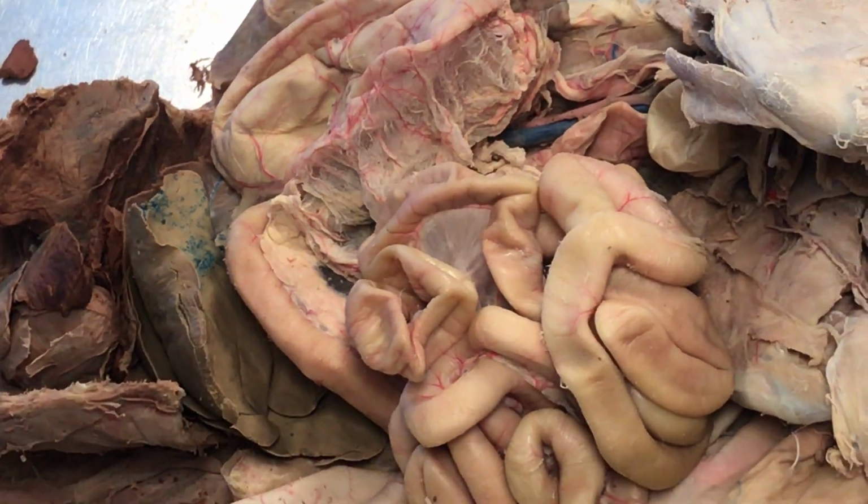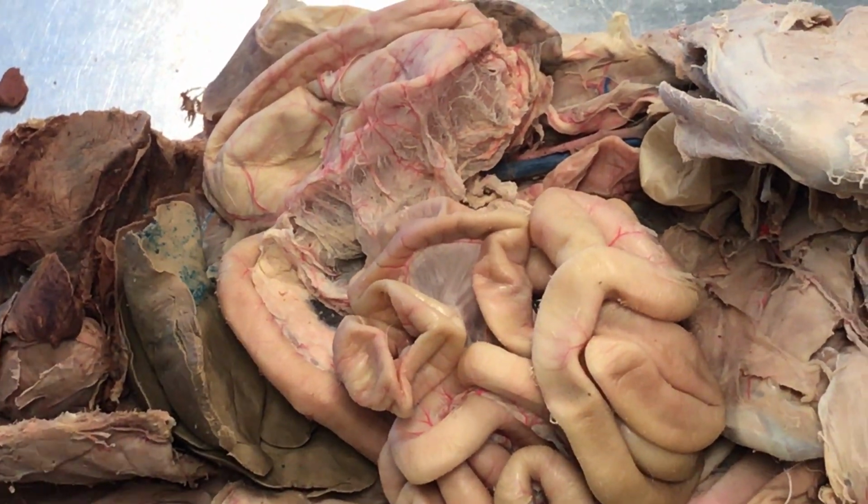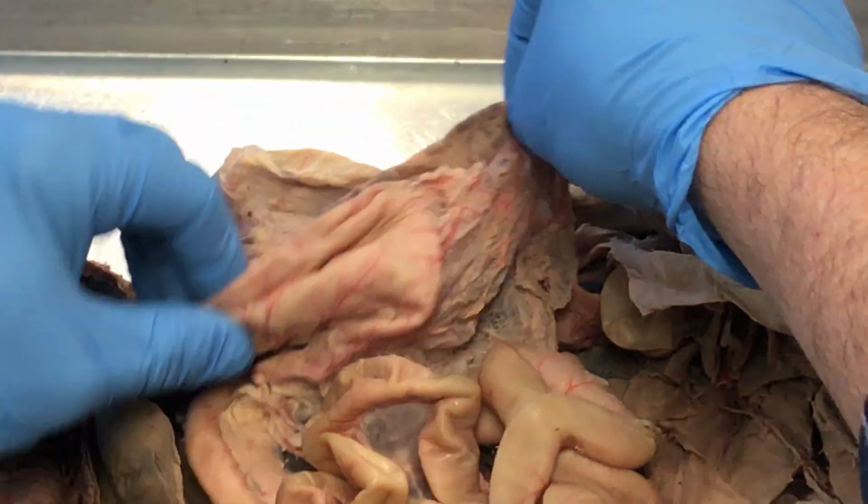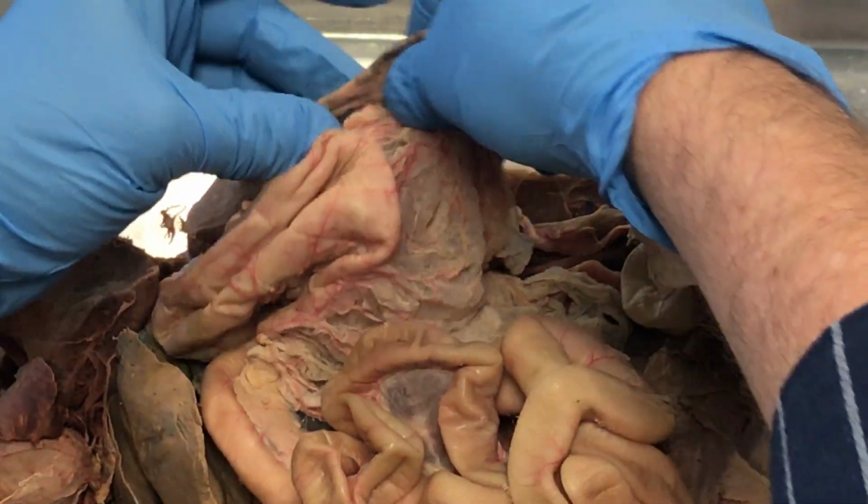Okay. And then we have spleen. The spleen is right here on the side of the stomach. Greater omentum, that's spleen right there.